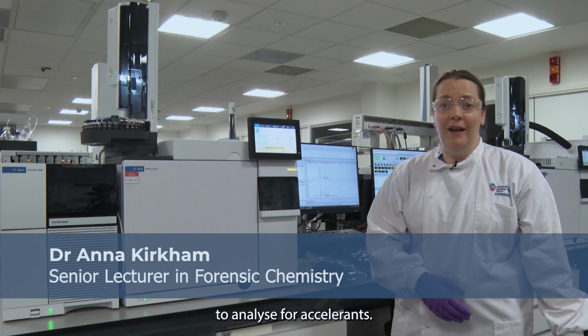I'm going to be showing you how to use GCMS to analyse for accelerants.